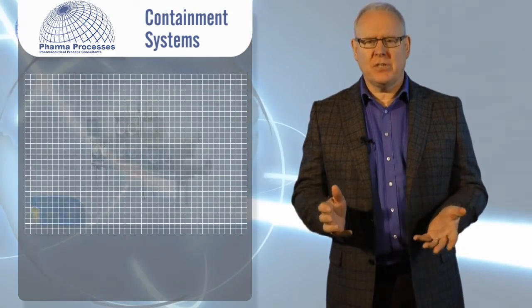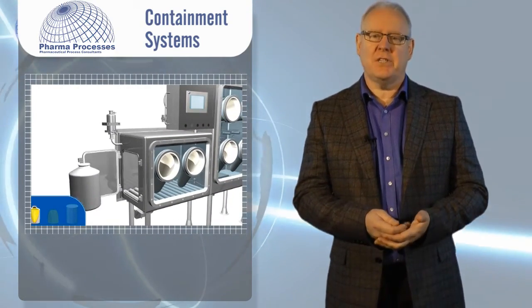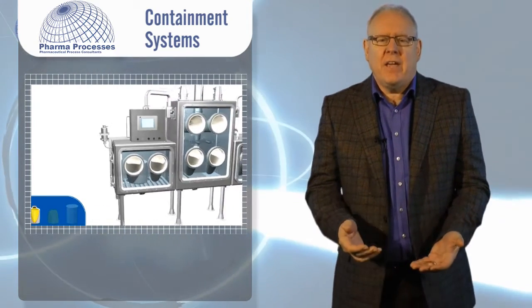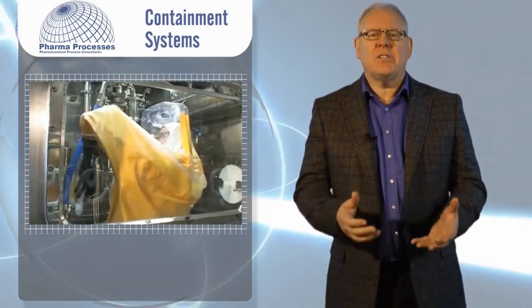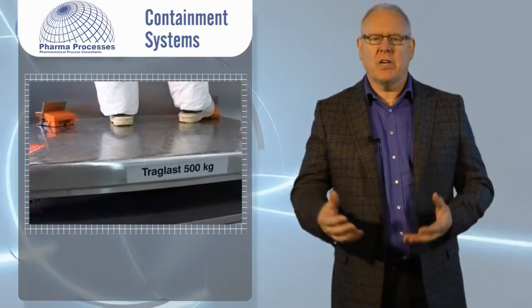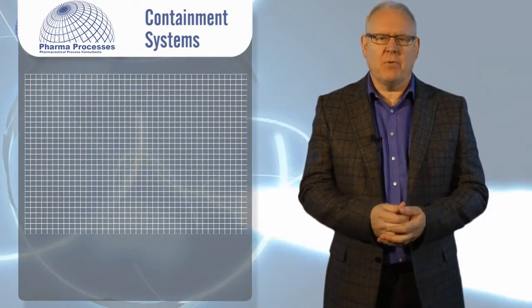An isolator is in effect a small room through which you access the process. There are 2 ways to do this. The first and most common is via glove ports. They benefit from being simple to use and easy to replace. However, when something becomes large, heavy, or difficult to manipulate, then we have a further option. That is the use of a half bodysuit. This is a simple bubble into the isolator, but it gives much more freedom, reach, and lifting abilities for the operator.